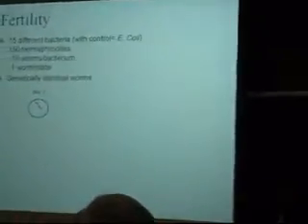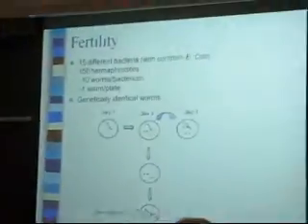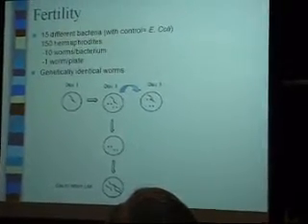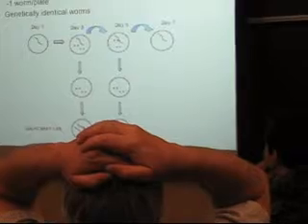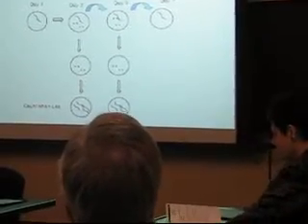My experiment was based on those 14 bacteria that Christopher had isolated, and with the control E. coli bacteria. And what I did was on day 1, I placed a virgin worm onto a plate. I waited a couple days, and if there was offspring on the plate, like these eggs, I would transfer the hermaphroditic worm onto a new plate, wait a couple days to see if the offspring grew up, and once they did, we would count them and record. And we would keep going until the hermaphrodites stopped reproducing. And then after that, we still looked at the worm daily until it died, and then we recorded how long it had lived for. And we did 10 worms per bacterium, 1 worm per plate, so there was 150 altogether, and these were all genetically identical worms.